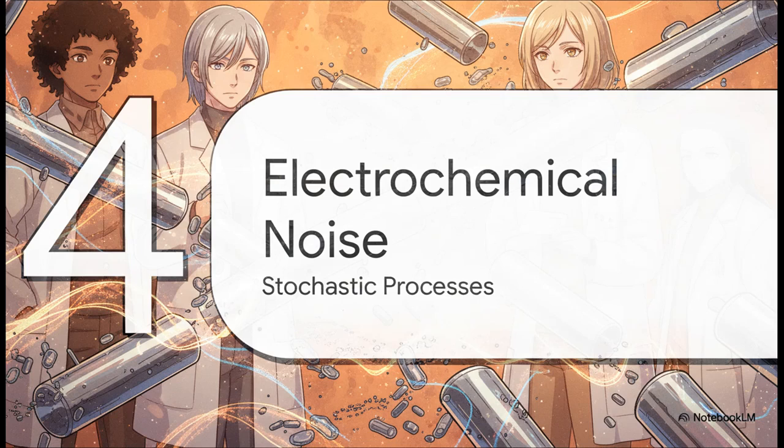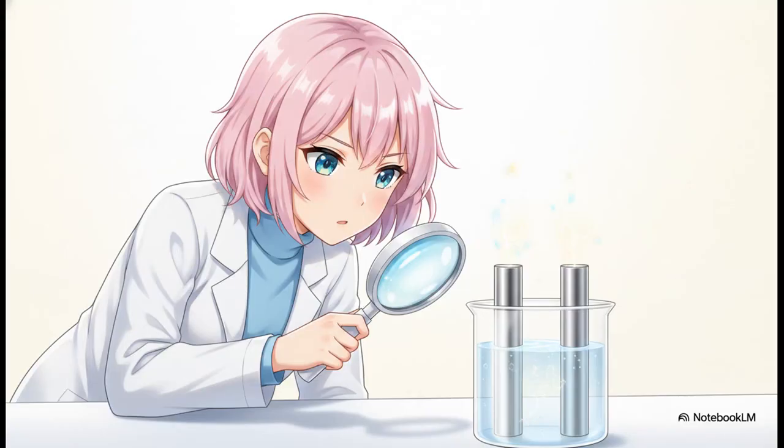All right, on to Section 4, Listening to Electrochemical Noise, Uncovering Stochastic Processes. This part is just fascinating. What if we don't apply any external voltage or current at all?